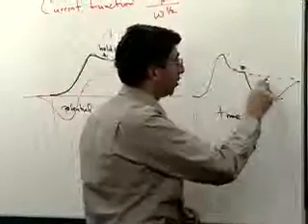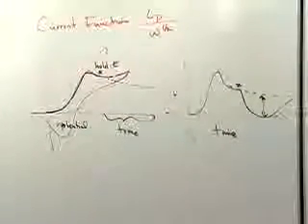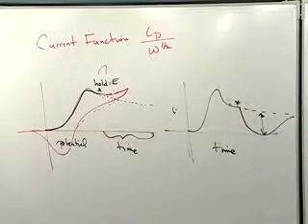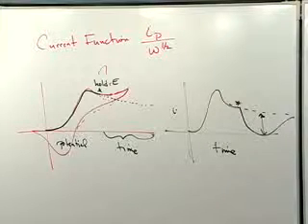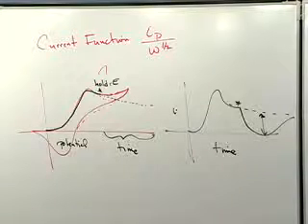That makes it very easy. Or in the case of an XY recorder, they often have time bases on them also, so you could run one that was a regular current voltage, and then right on top of that, a current time plot. Give you the same result, just holding your potential right there. Scan at the normal speed, hold your potential right there. So that's a very good way to do that.